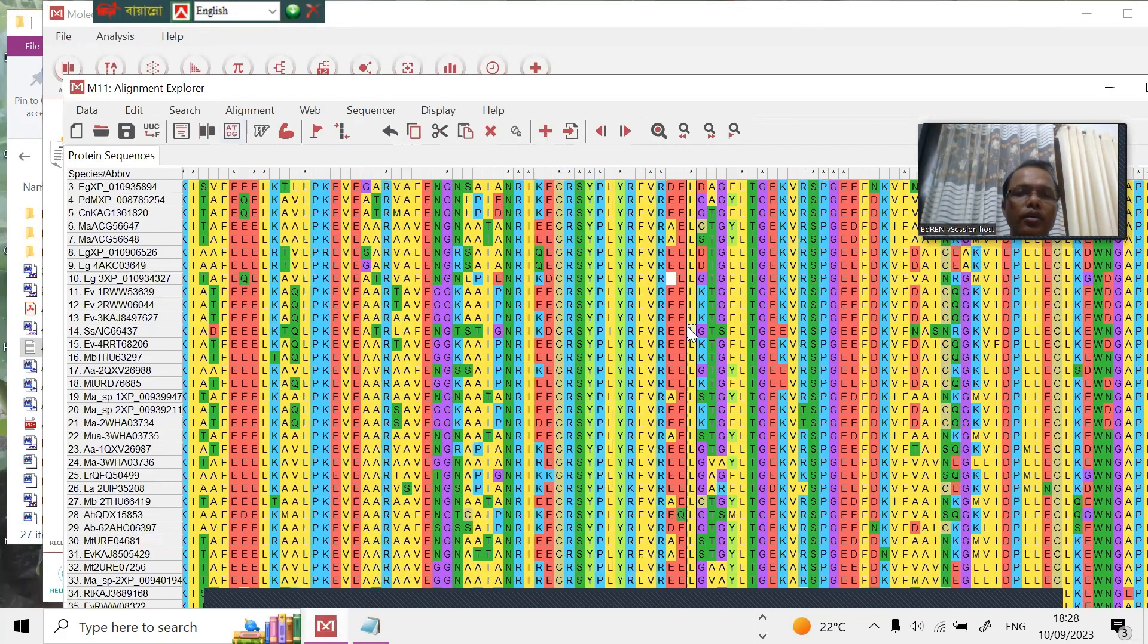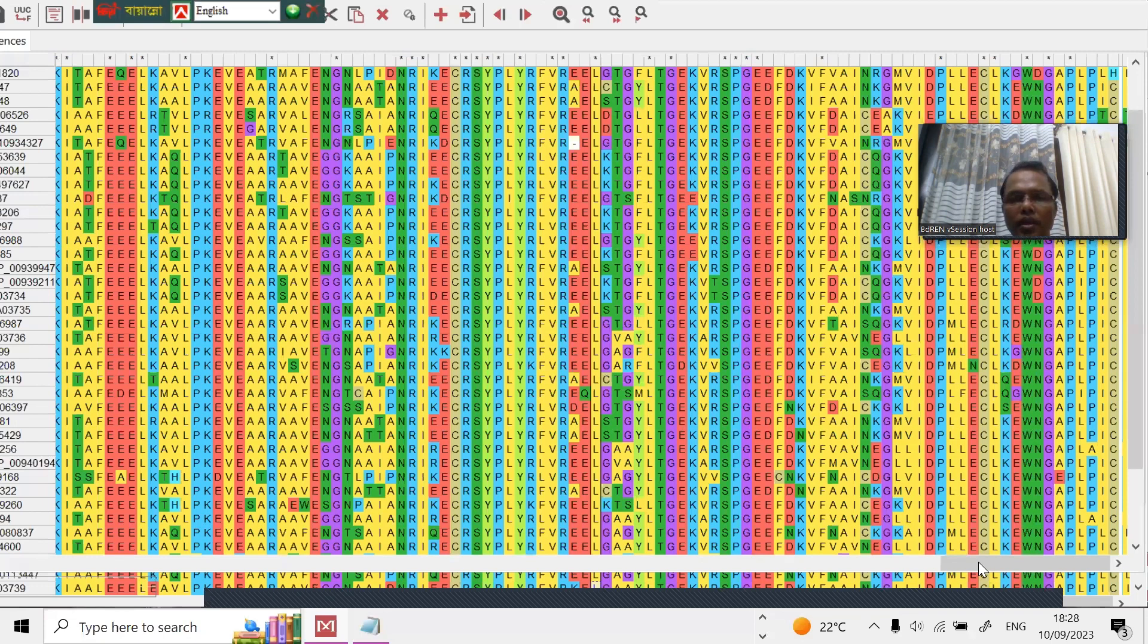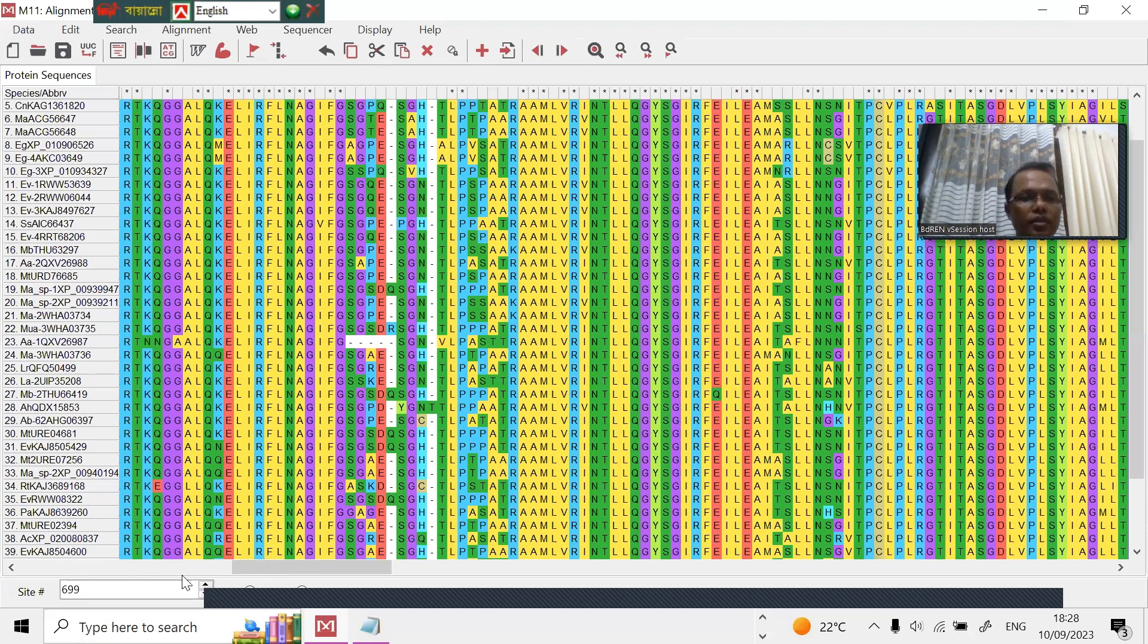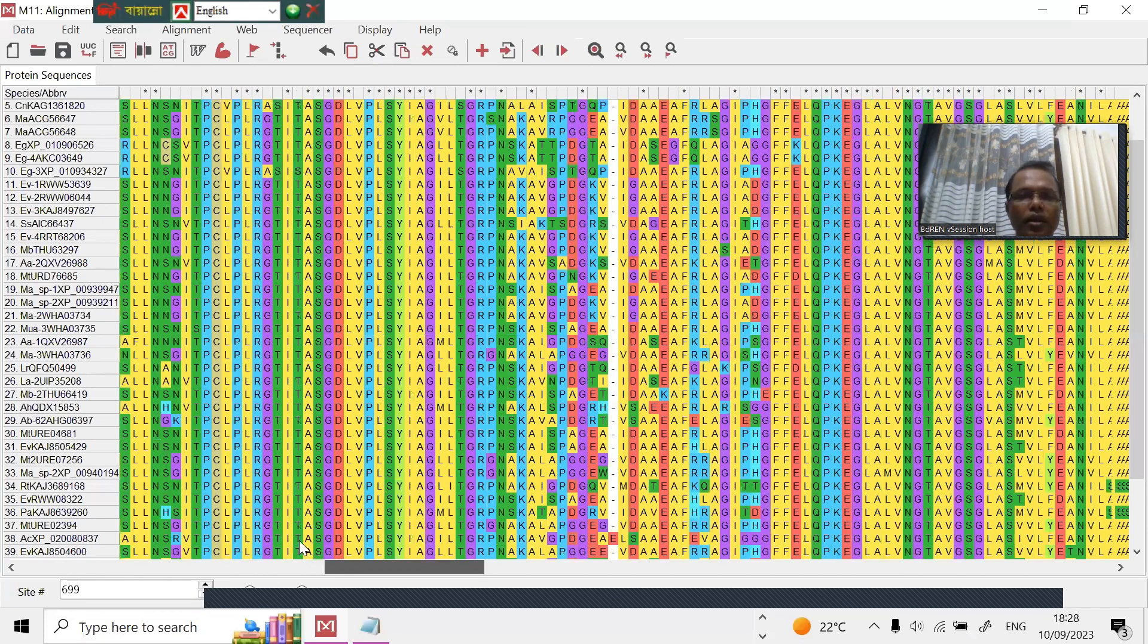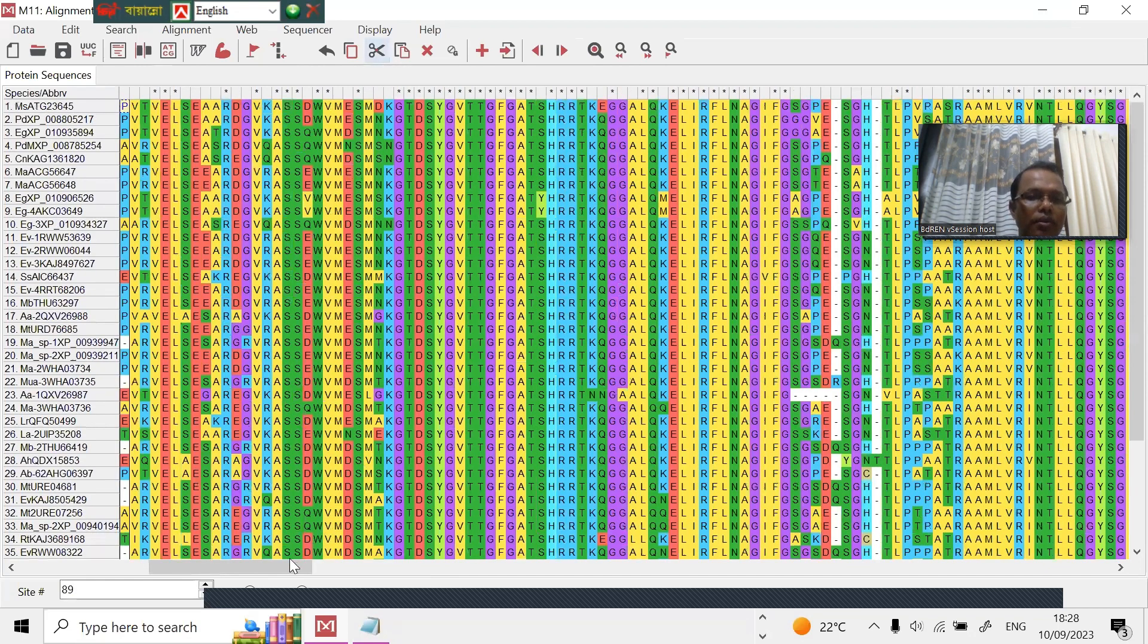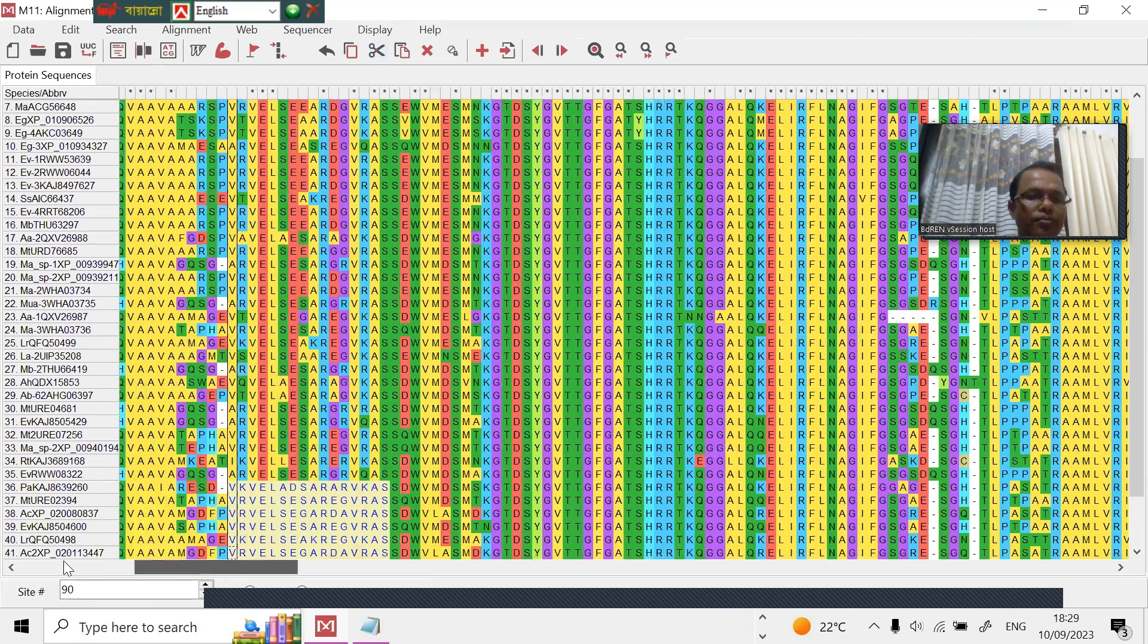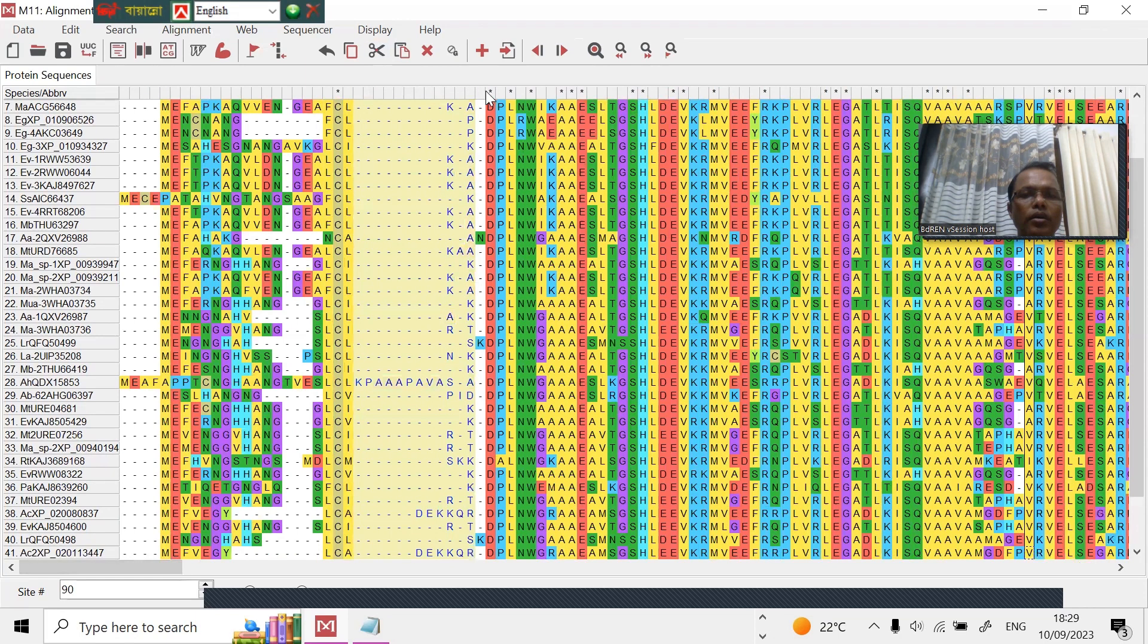This one is already aligned here. You can see the alignment, very good alignment. But here and here is some gap, you see the gaps. So we have to delete the gap. Cut the gap. And here also some gaps. From here you can cut the gap, delete the gap.